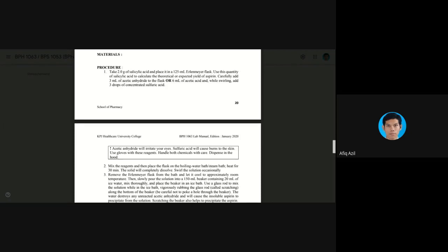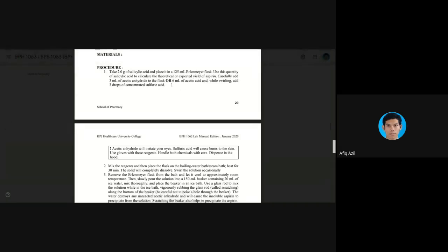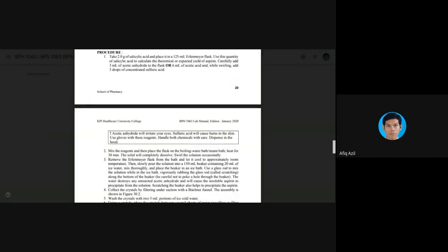Okay, so in this first step, when you mix all of this together, the whole thing will sort of clump up together. It won't produce any clear solution or homogeneous mixture. That will happen on the next step.